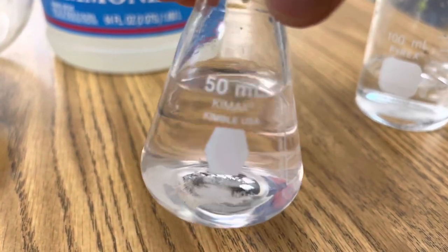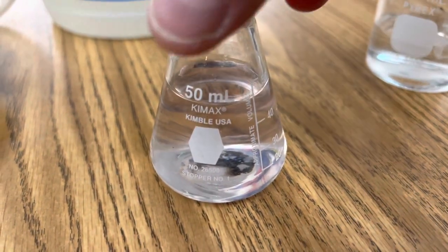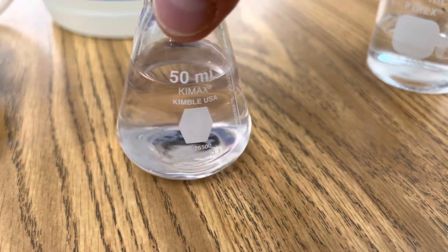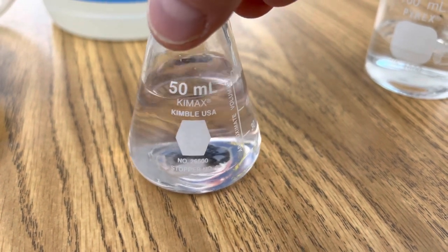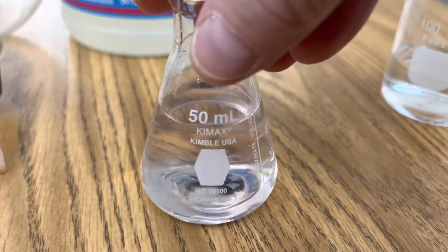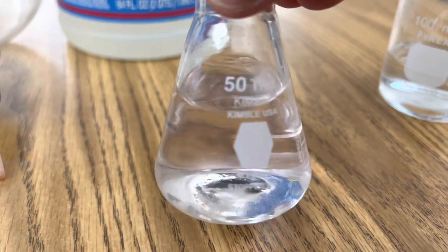Phenolphthalein, when there's a pH of less than eight — when the solution is either neutral or slightly acidic — is clear. And when it has a pH level of more than eight, that's when you know the solution is alkaline or base. So ammonia should definitely turn the solution to a bright pink, but right now we can see it's clear.